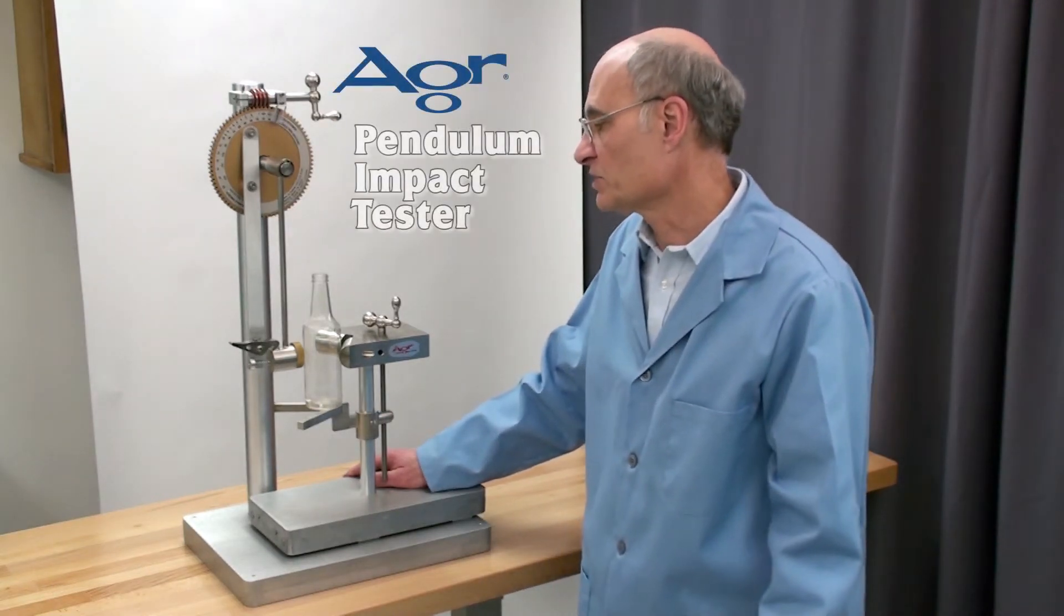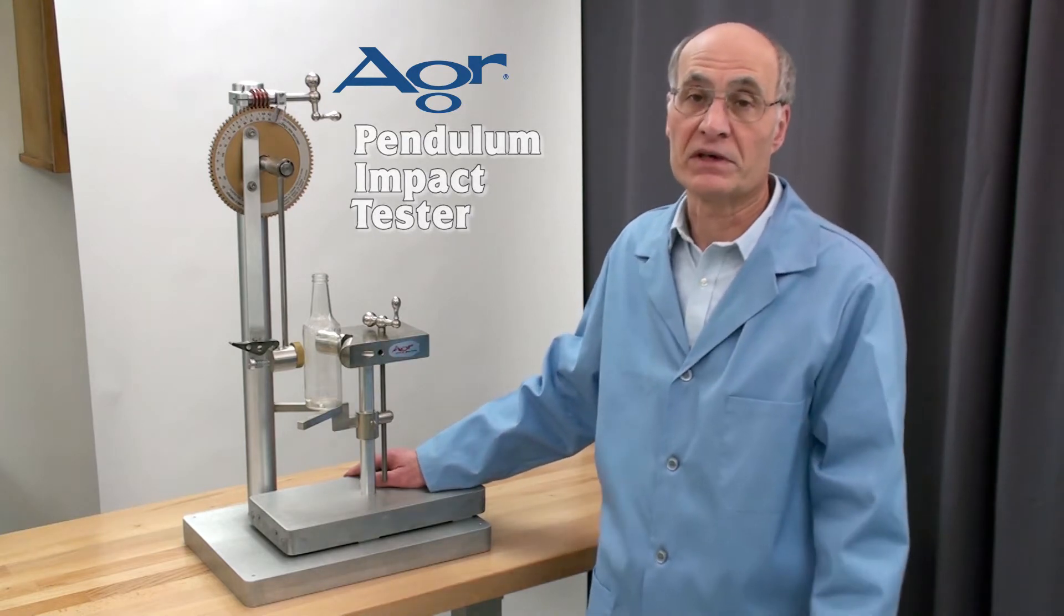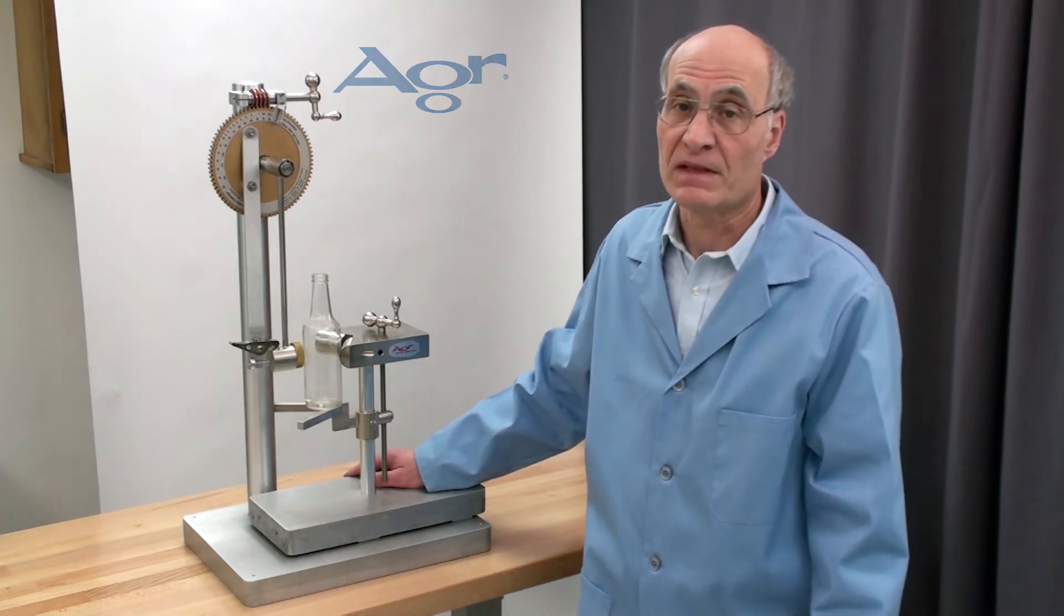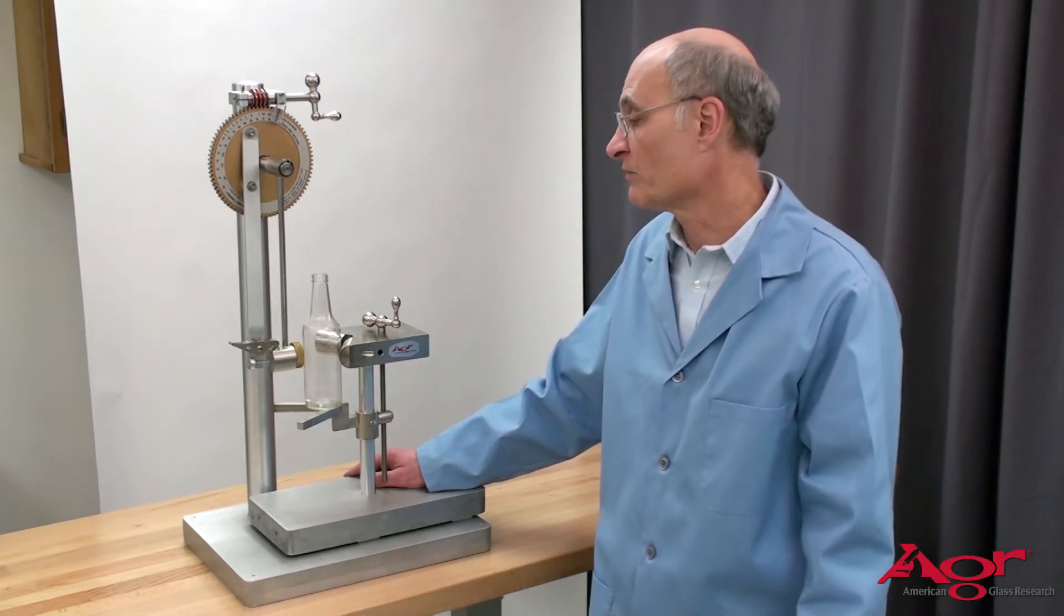This is the AGR pendulum impact tester. It's a real good method for evaluating impact resistance of bottles. There's not a lot of adjustments to make. There's three primary adjustments you have to be aware of first.